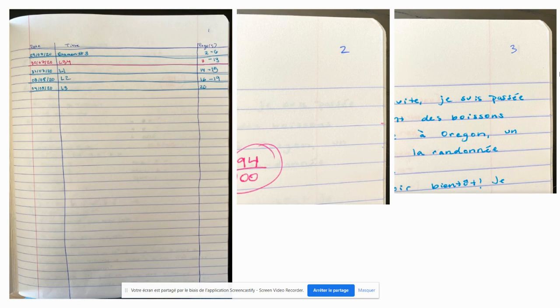So I've got some pictures of my notes. So these are actually not from a lab notebook. This is from my personal notes. So hence why you're actually seeing some pink in there, but typically it'll just be blue. So you see in the top right-hand corners, I just numbered my pages 1, 2, 3. You could go ahead and number all of the pages in your notebook, or what I personally do is I just number 1 through 10. And then once I get to the next section of 10, I number them. I actually use this style of note keeping for everything I do, not just for lab notebooks.